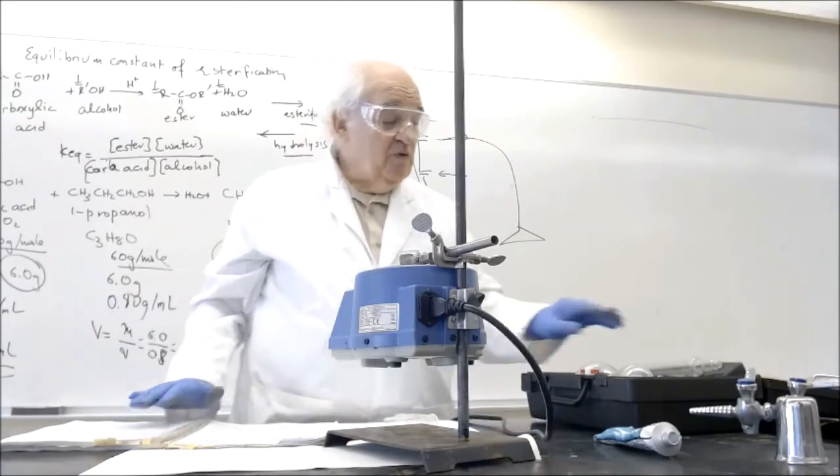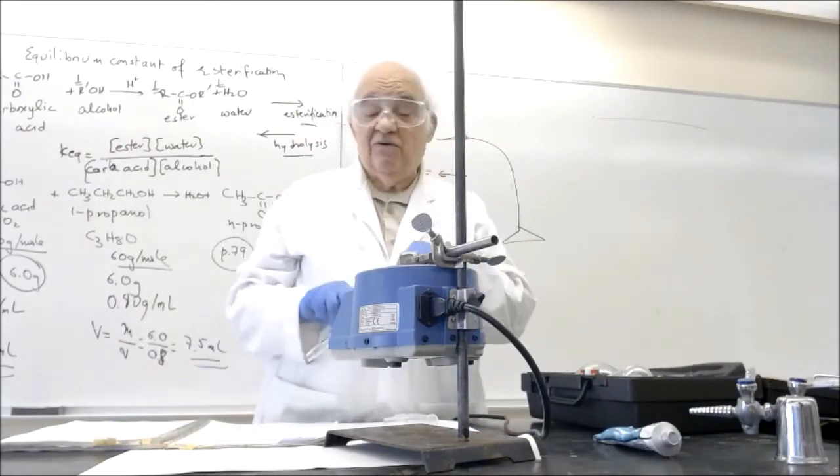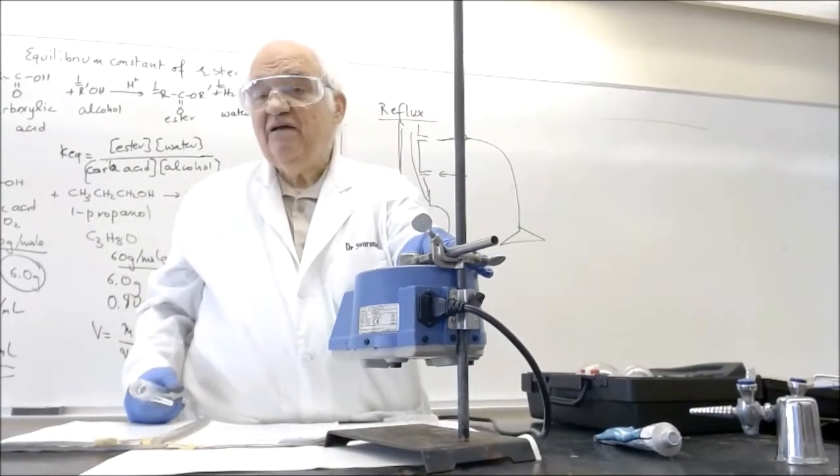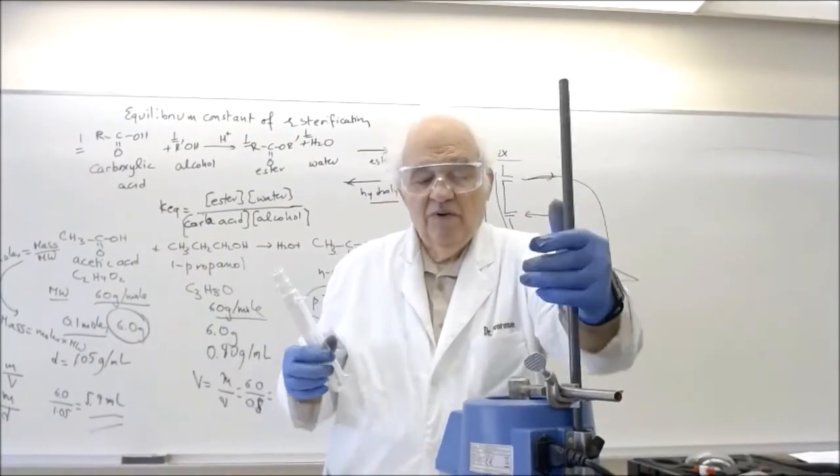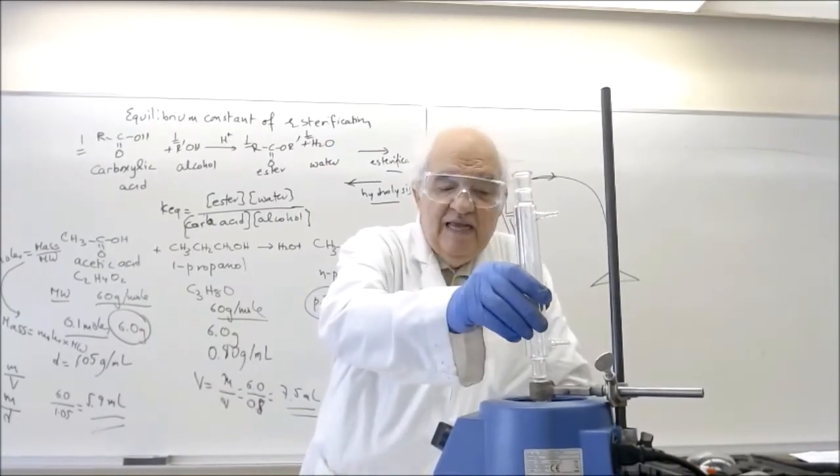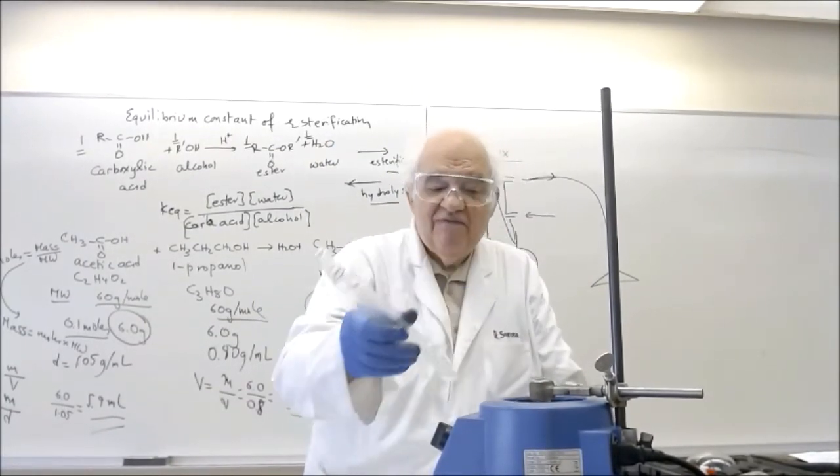Okay, so what we do is we have the round-bottom flask that is clamped. So you get a clamp that is going to be tight. So we will bring this round-bottom flask. Make sure the round-bottom flask actually touches the heating mantle. You must touch the heating mantle. Otherwise the current of air that goes through is not going to heat it up efficiently. And the reaction will not take place as it should.